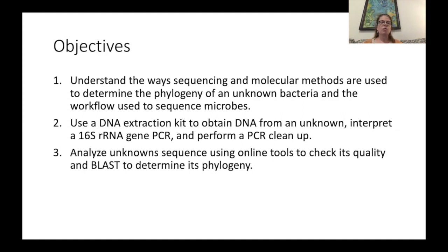You then would get the sequence. We would send the sequence out to a sequencing facility and analyze it using online tools to check its quality, to determine what that sequence actually is, and to determine what the organism is that corresponds to that sequence. And that is the part of this exercise that you will have an opportunity to do.